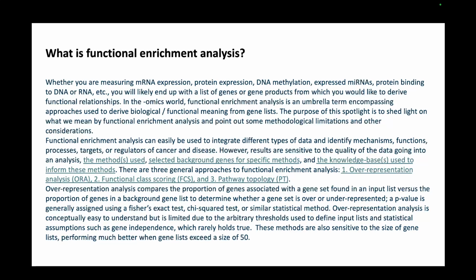So for example, why are we interested in doing this for functional enrichment analysis? Because the results that you'll get from differential expression analysis will tell you only half the story. Say you have 5 genes that are highly expressed. You cannot claim that those 5 genes are the reason for this condition in the sample. That is not the case, because when one gene upregulates itself, that gene is part of a network, it's not acting alone.